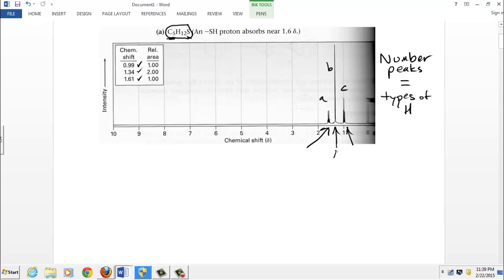Okay, so as a preliminary guess, I'm going to say maybe these are alkanes. Actually, all 3. They might be all 3 are alkanes. But there's that sulfur atom in the chemical formula. So maybe a thiol or a sulfide. And I'm leaning towards the last one for that, just based on position, thinking the sulfur atom might be the most electronegative and shifting it downfield. Okay, that's my guess. Remember, correlation table, don't trust it overly. But it's a nice start.